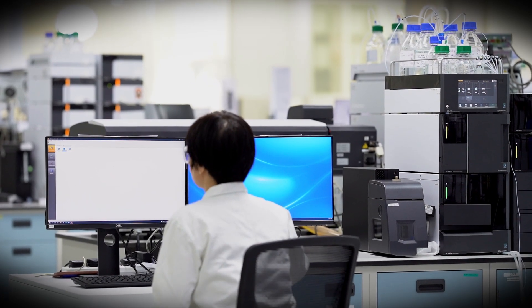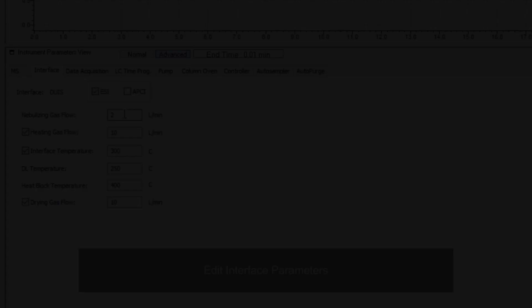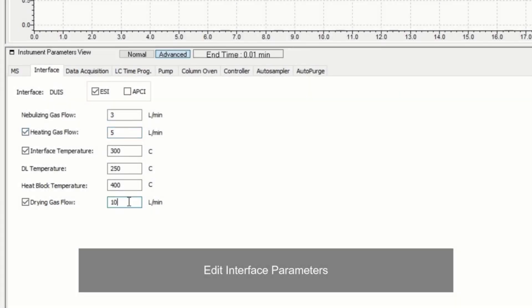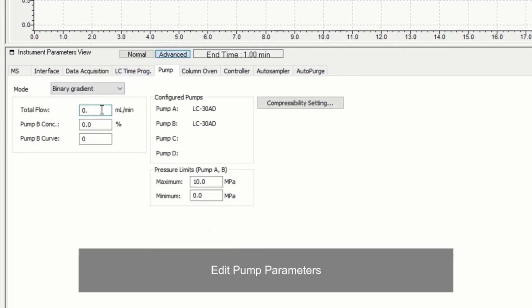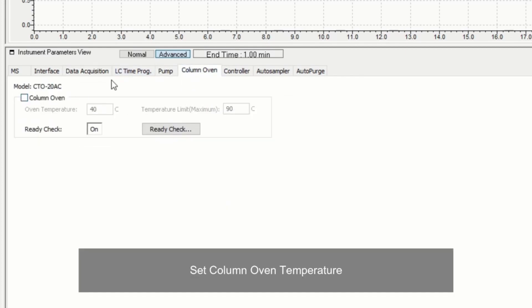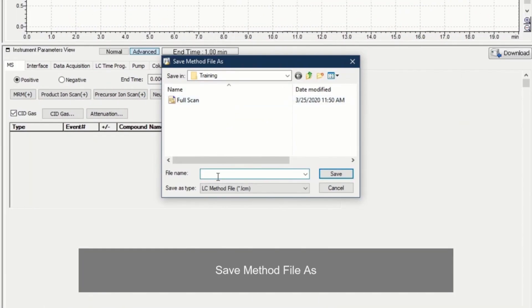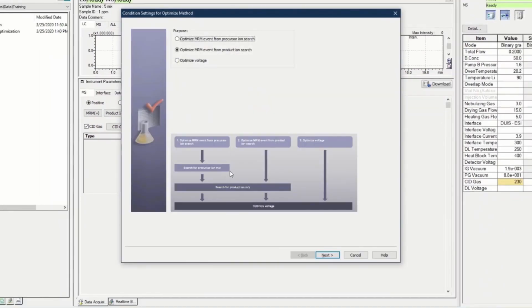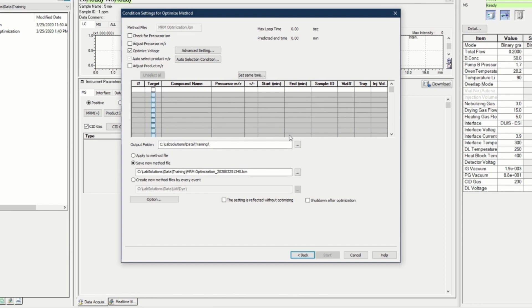Let us look at the procedure to perform automated MRM optimization using LabSolutions. First, create a new method file and input values for interface parameters, acquisition time, pump parameters, and oven temperature. Then download the method to the instrument. Press the Optimization for Method button at the left panel to begin the automated MRM optimization. Remember to name and save your method file.